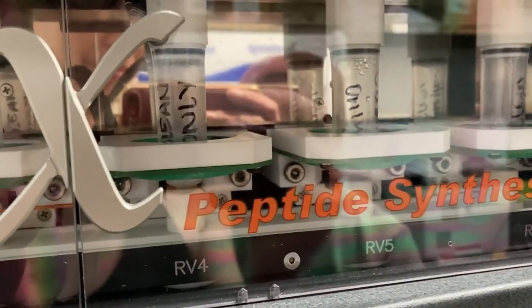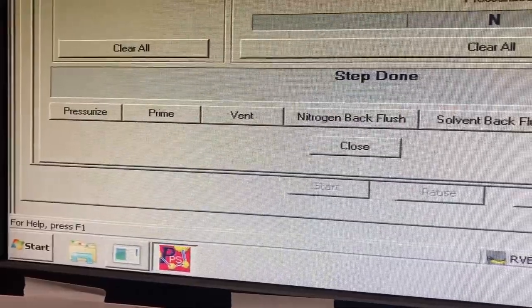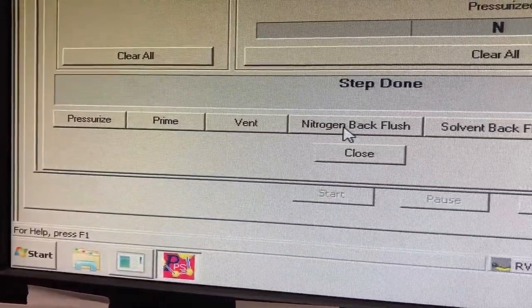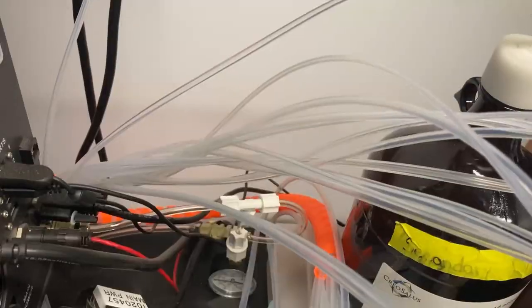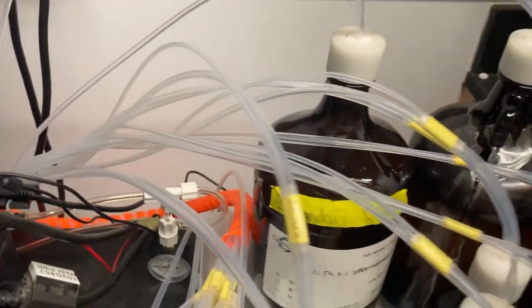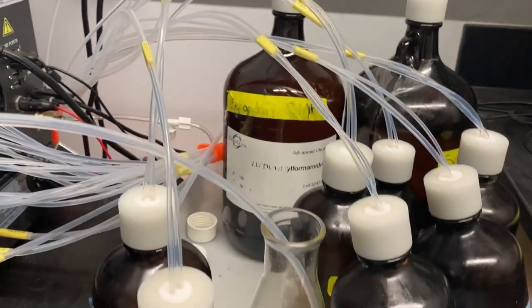Once that is complete, under bottle preparations, select all the amino acids and reagent bottles you used and run a nitrogen back flush. This runs nitrogen through the lines and flushes any remaining reagents back into the bottles.